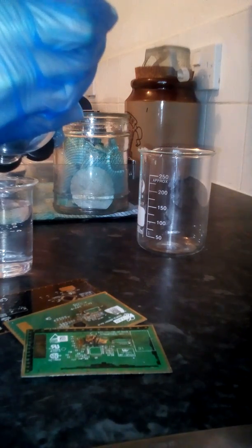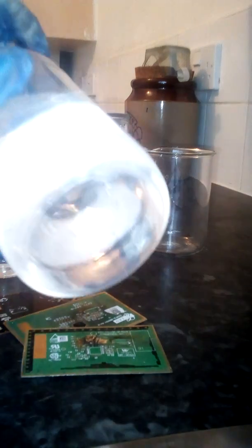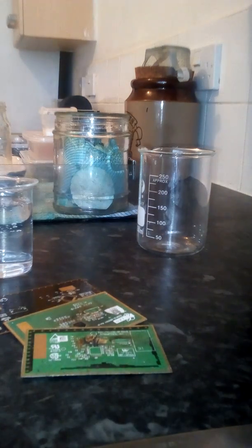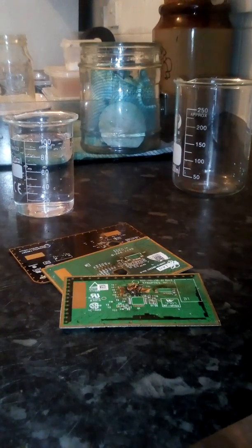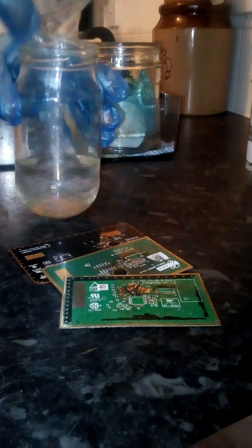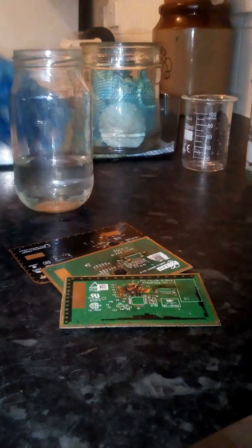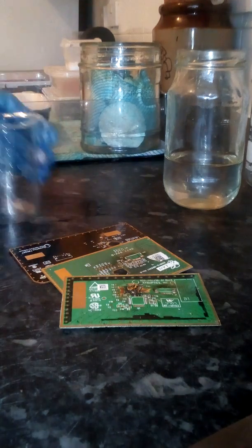I want 100ml of each, a tiny bit more. Here we go — using an old pickle jar for this. They seal quite well on the top.